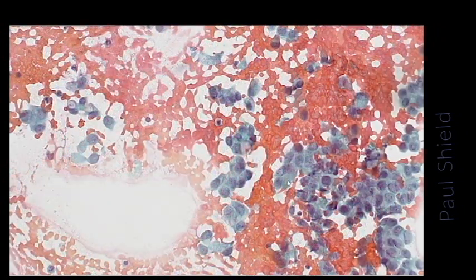Notice how much smaller the cells are because they're fixed, but the cells are very much in little acini groups, so cohesive epithelial type arrangements of cells. So we shouldn't see epithelial cells at all in a lymph node. So this is strong evidence that we're dealing with a metastatic carcinoma.